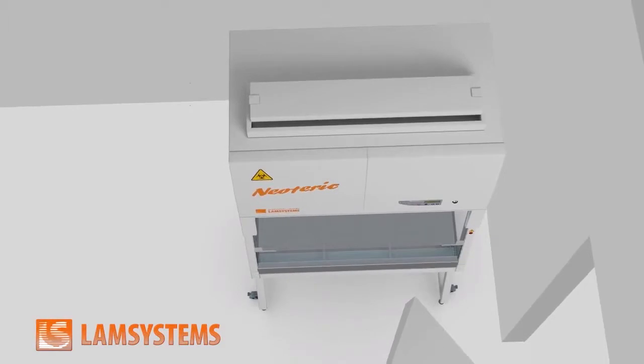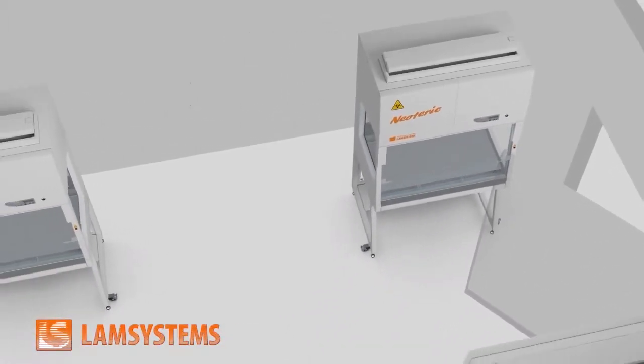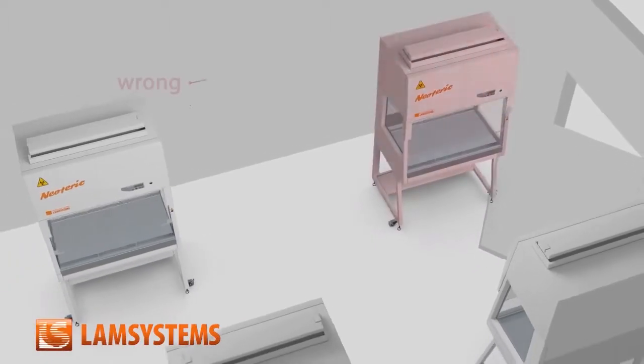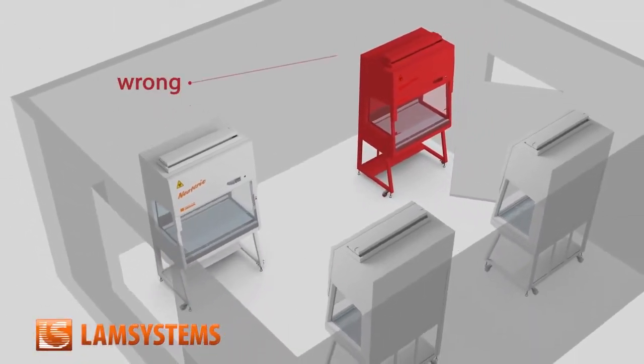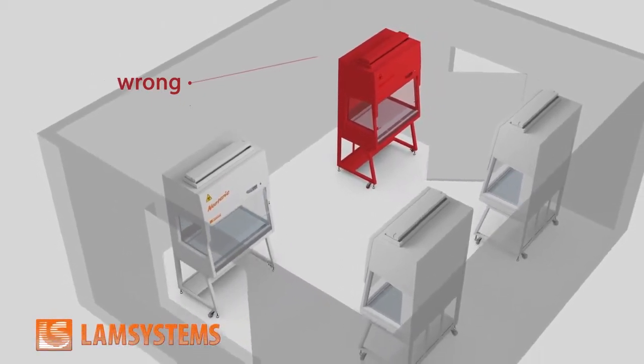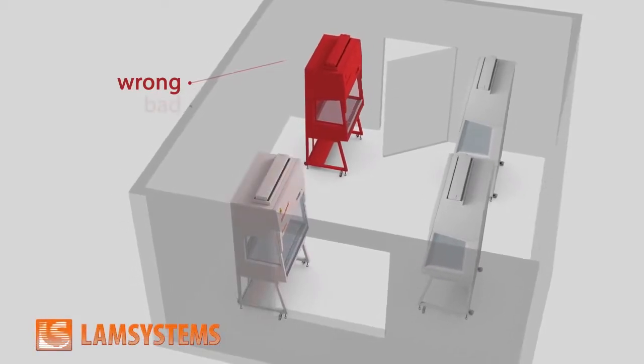After the unpacking and assembly of the cabinet, you should choose its correct location in your laboratory. According to the recommendation of the World Health Organization, a biosafety cabinet should be installed considering the existing air flows from windows and doors so that it would avoid drafts influencing the airflow in the cabinet.